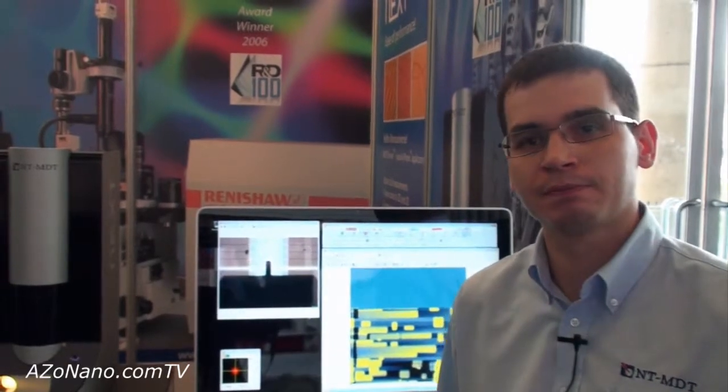You've been selling these all over the world? Yeah, we have our headquarters in Moscow, Russia, and we have branch offices in the USA in California, in China in Shanghai, in Europe in the Netherlands and in Ireland Limerick. We have a distribution network all around the world with agents in more than 50 countries.